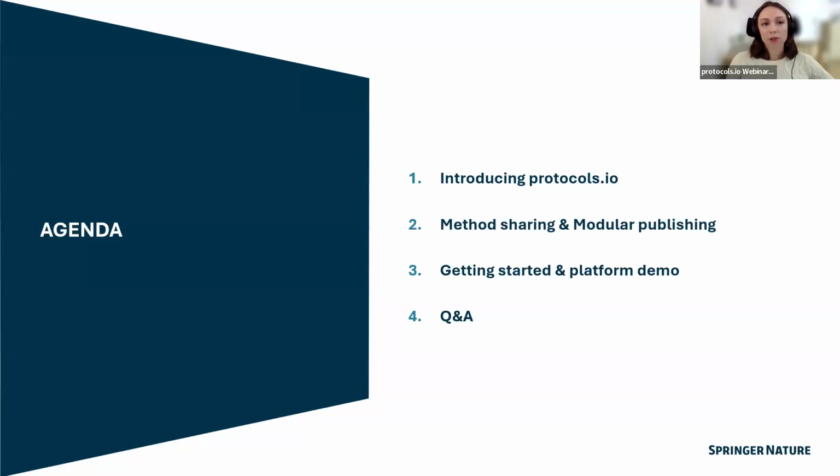So in terms of what I'll cover in our intro presentation today, I'll of course introduce Protocols.io on a high level, what we're about. I'll also talk about how it plays into method sharing more broadly, as well as the concept of modular publishing. So that'll be about maybe 15-20 minutes of slides. And then after that, I will jump into the Protocols.io platform and show you how to get started and how to do some of the basic functionality.